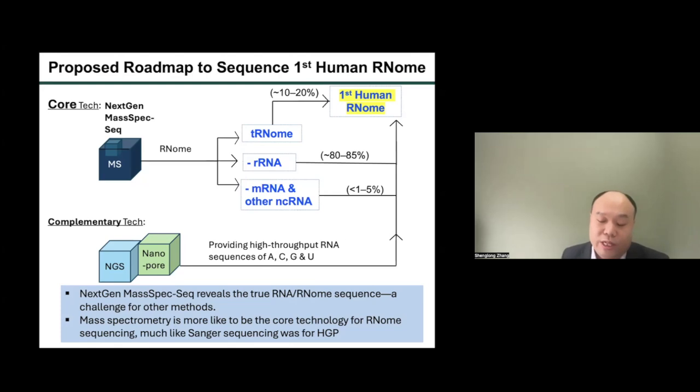The sequencing capacity, of course, is not comparable to current high-throughput sequencing technology, but as long as we can achieve a sequencing throughput like Sanger sequencing, that's significantly enough. After all, Sanger sequencing is the sequencing technology that was used for completing the first human genome project.